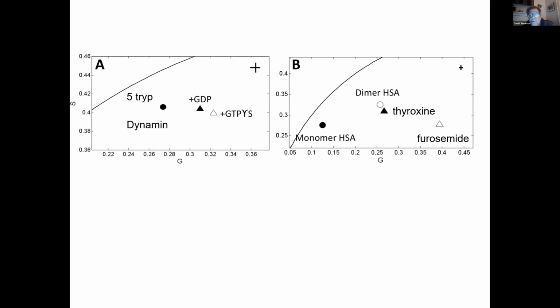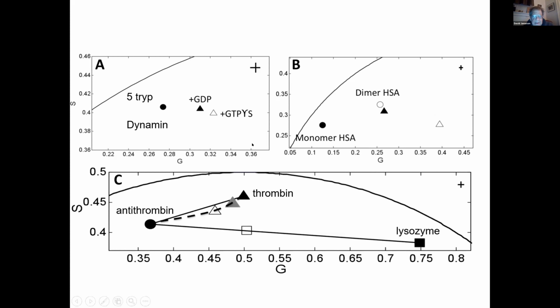In fact, I bring this point out because many people in the literature have used HSA right from the bottle, lyophilized, and you always get about 15% of dimer HSA. And you can see there's a difference in the lifetime. So for God's sakes, if you're doing HSA, purify, get monomer, not right from the bottle, which is in a lot of the literature.